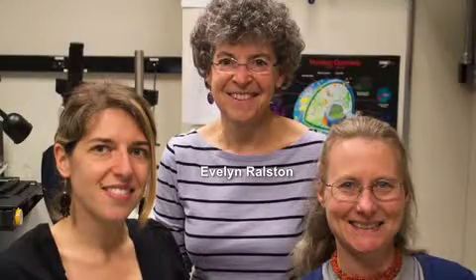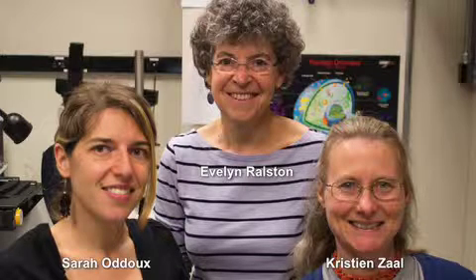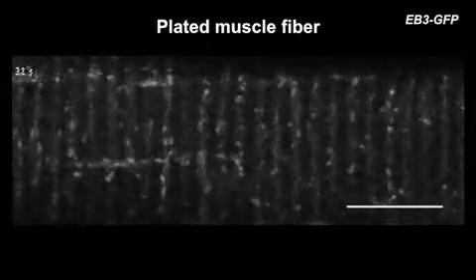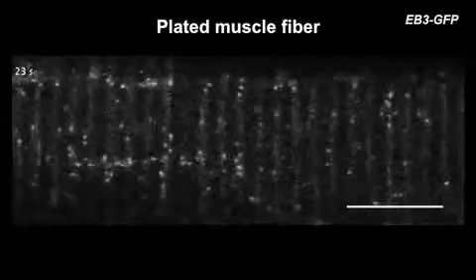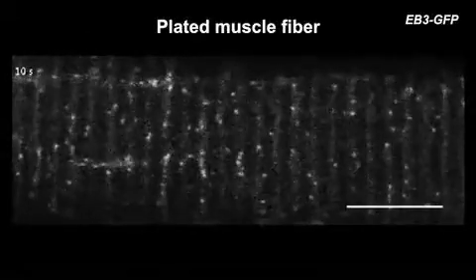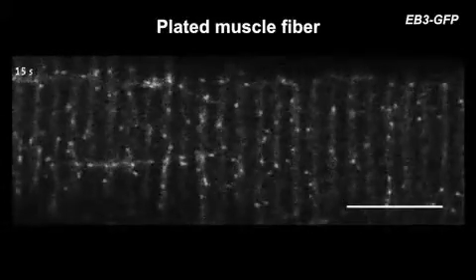Ralston and colleagues, led by Sarah Oddoux and Christine Zahl, therefore observed isolated muscle fibres expressing a GFP-tagged version of the microtubule plus end marker EB3. In principle, EB3-GFP is only bound to dynamic microtubules. So we were extremely surprised and excited really when we saw that all the microtubules that we see by immunofluorescence seem to be actually growing and dynamic.